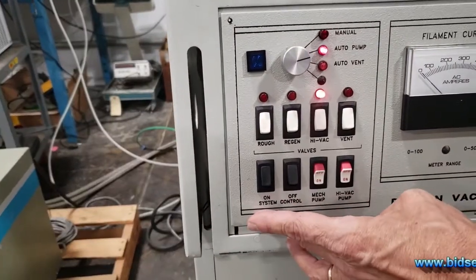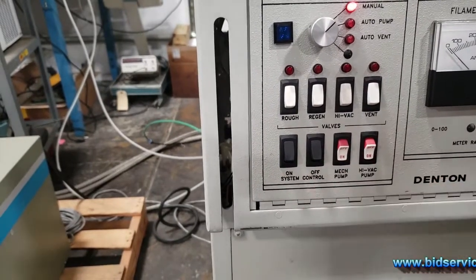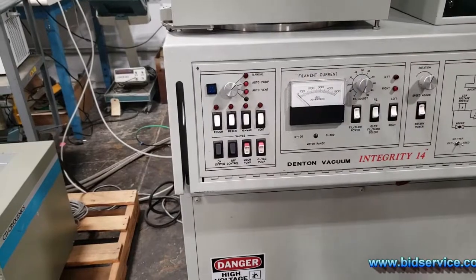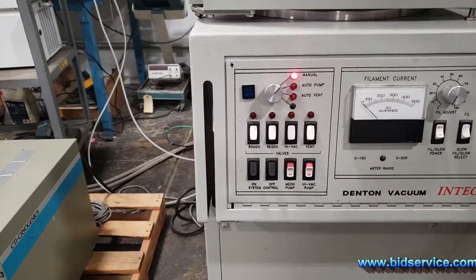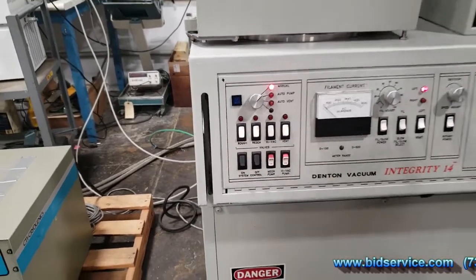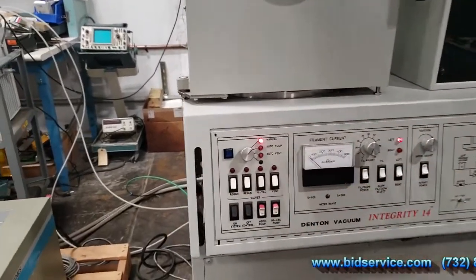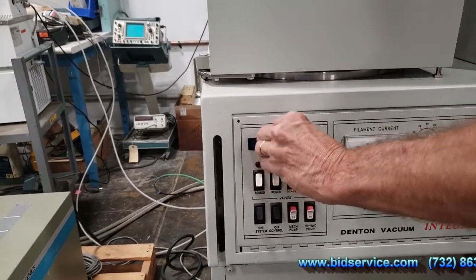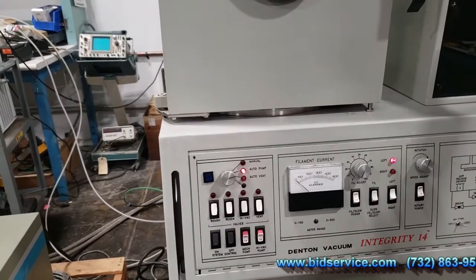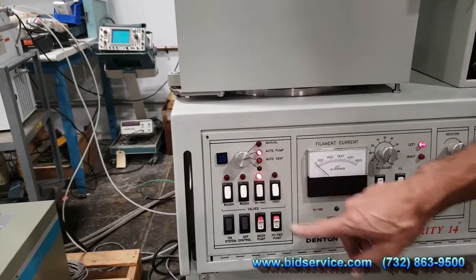Here are your system controls — mechanical pump on/off switch right next to your high-vac pump on/off switch. You can turn it off and on. I'm going to switch this to manual to demonstrate quickly. It's interlocked — if you pull this panel down, everything shuts down, and you'll want to turn it back on. In manual, you can operate any of your valves: rough, regen, high vacuum, vent. You can also do an auto pump-down; at that point the PLC takes control and pumps down to a crossover point set in your vacuum controller, then automatically switches over to high-vac.